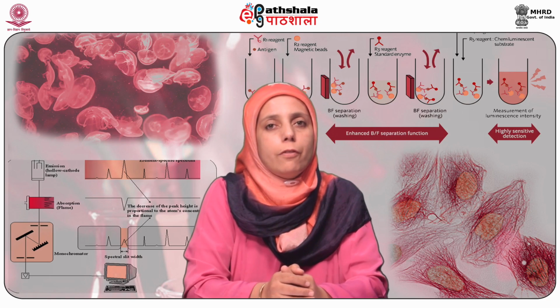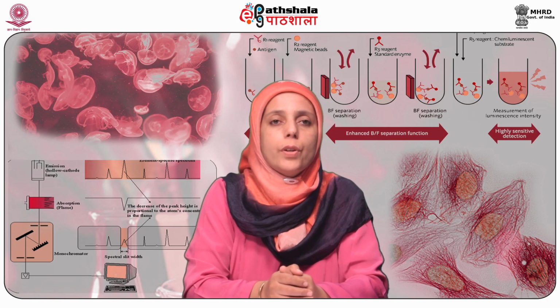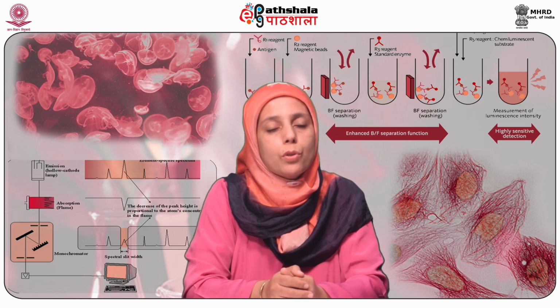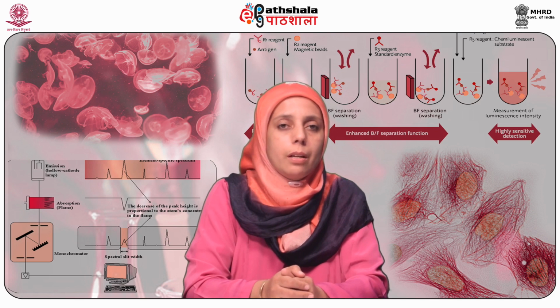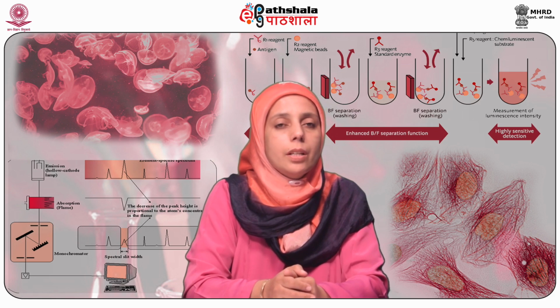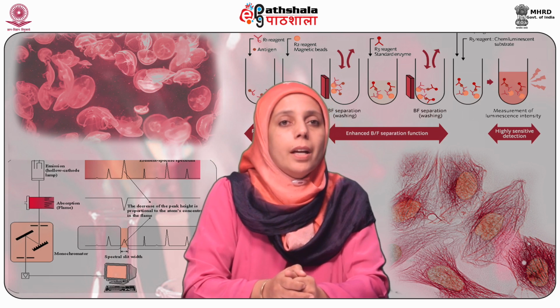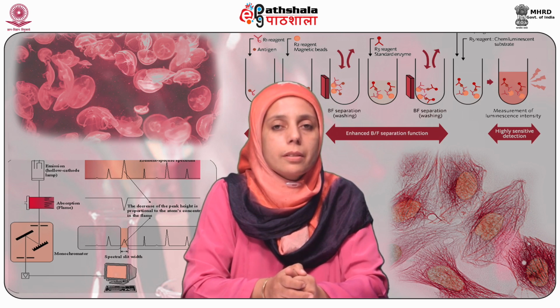Now, why we say fluorescein and rhodamine? Because they have few advantages over other fluorophores available. They have high quantum yield. That means almost most of the molecules which absorb energy release their energy in the form of emission. They have long absorption and emission wavelengths. The lifetime is near 4 nanoseconds, that is quite long enough to be recorded. They are non-sensitive to polarity of solvents and are suitable for quantifying the association of small labeled molecules with proteins by change in fluorescence.